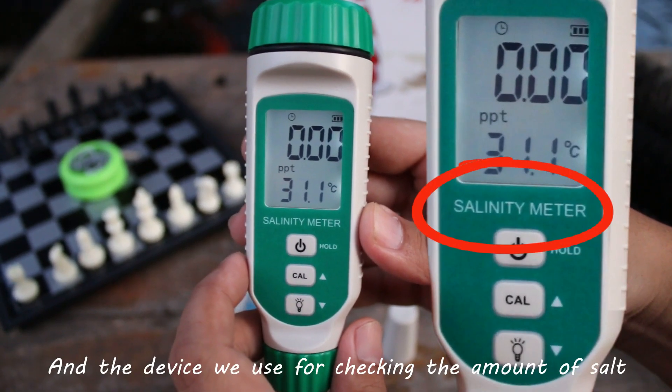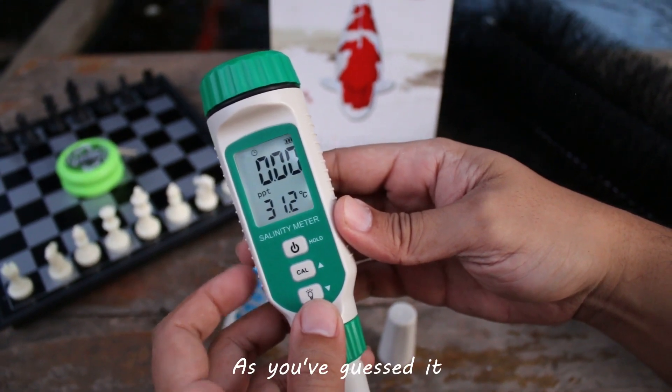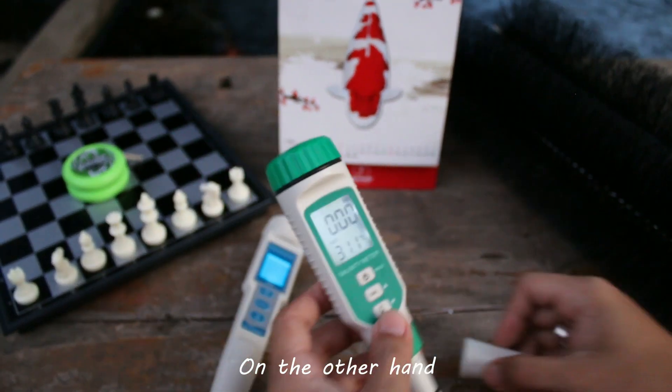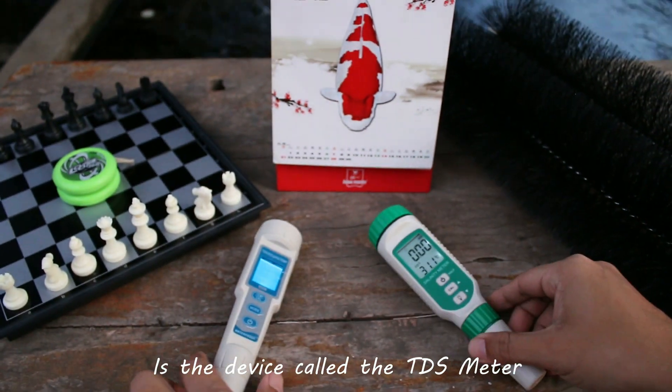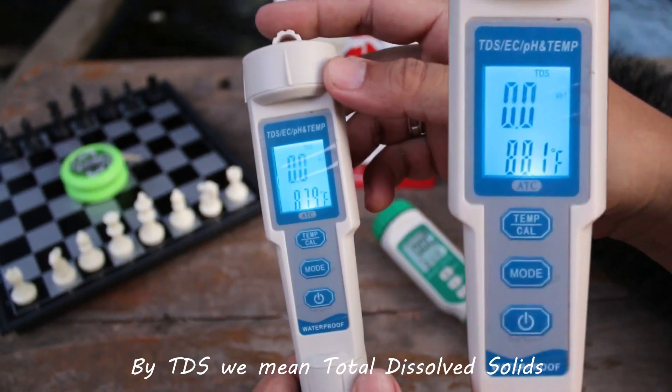And the device we use for checking the amount of salt dissolved in a body of water is, as you've guessed it, the salinity meter. On the other hand, is a device called the TDS meter. By TDS, we mean total dissolved solids.